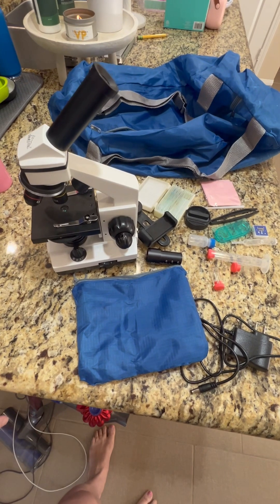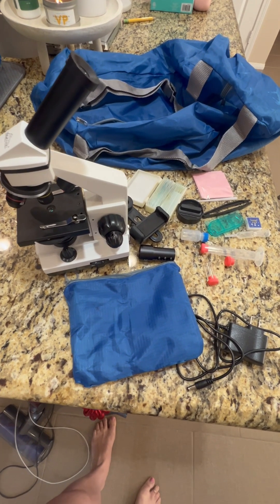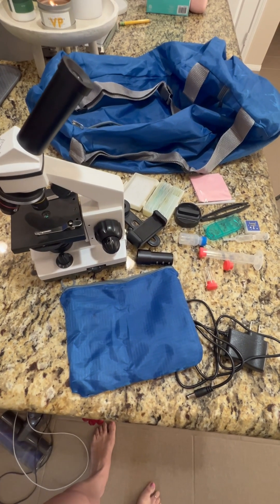If you are looking for a fun and good microscope to do with your kids or yourself as an adult, definitely check this one out.